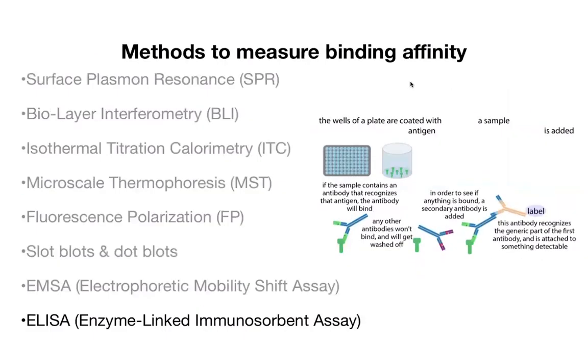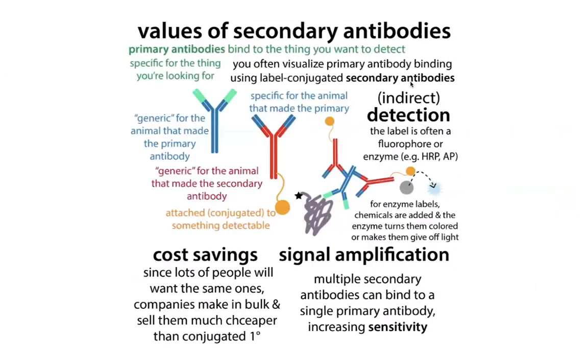Another acronym starting with an E is an ELISA, or an enzyme-linked immunosorbent assay. We're going to talk a lot in the lab about how we can use antibodies to our advantage in biochemistry. You probably think about antibodies more in terms of your immune system, but antibodies are really useful in the lab as well because they're able to detect specific things.